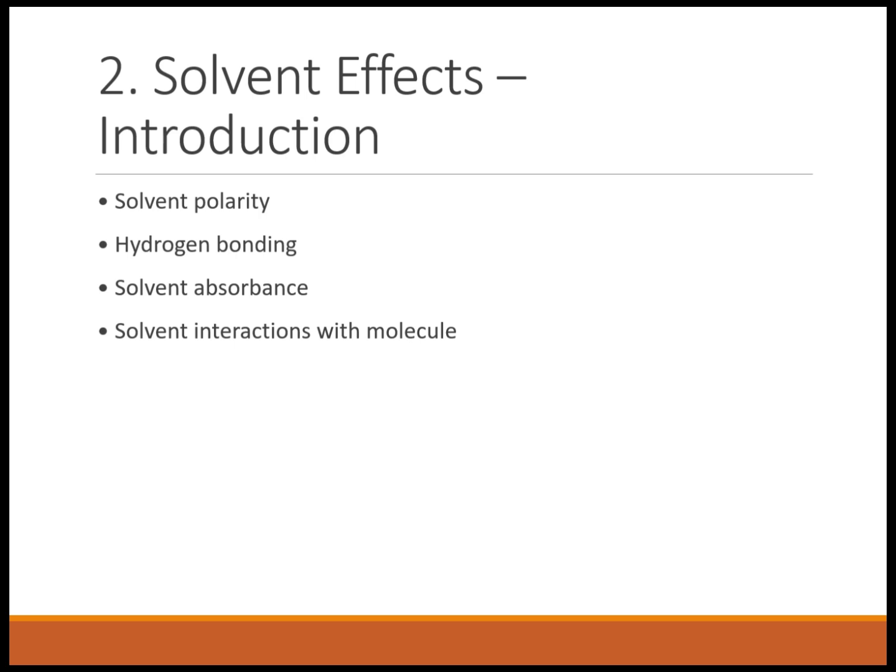Solvent effects. Solvents interact with the analyte, influencing electron distribution and energy levels. Solvent polarity, hydrogen bonding, and intrinsic solvent absorbance all significantly affect UV visible spectra.